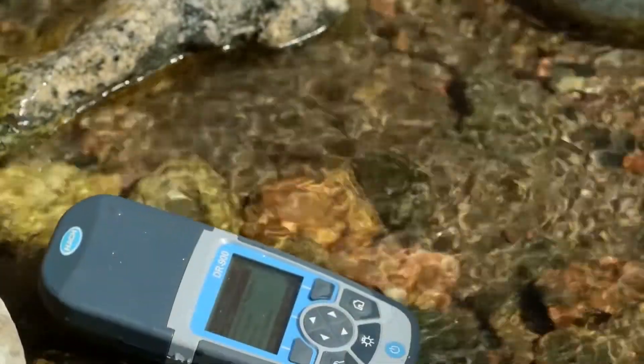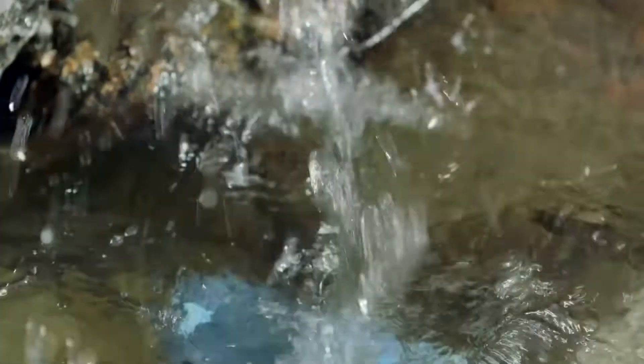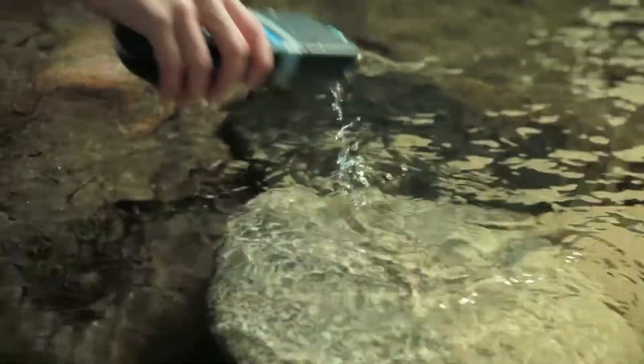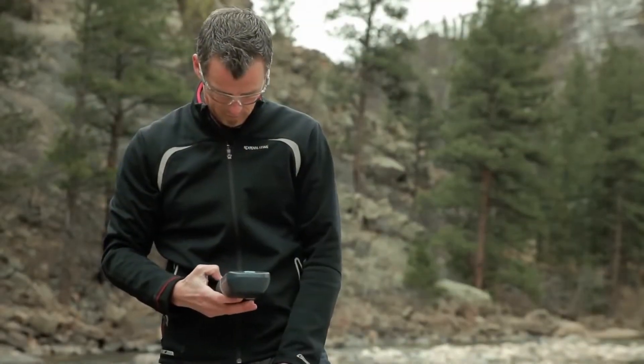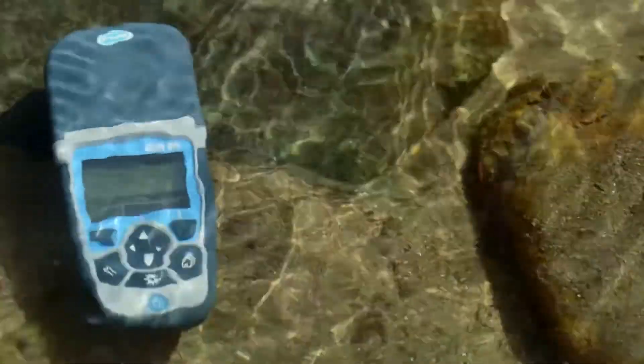Your testing equipment should be waterproof so you don't have to stress about dropping when you are in the field. The DR900 has an IP67 waterproof rating so you have nothing to worry about. The DR900 makes water testing in harsh field environments a little less challenging.